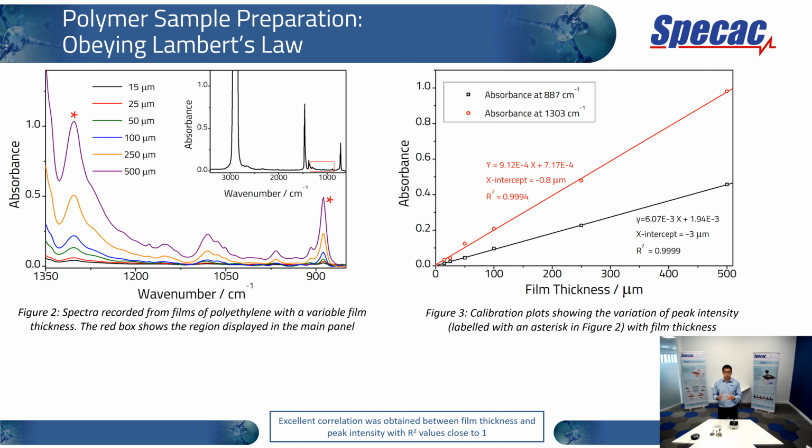And in the calibration plots, you really do see an excellent correlation being obtained with the R² values very close to 1.